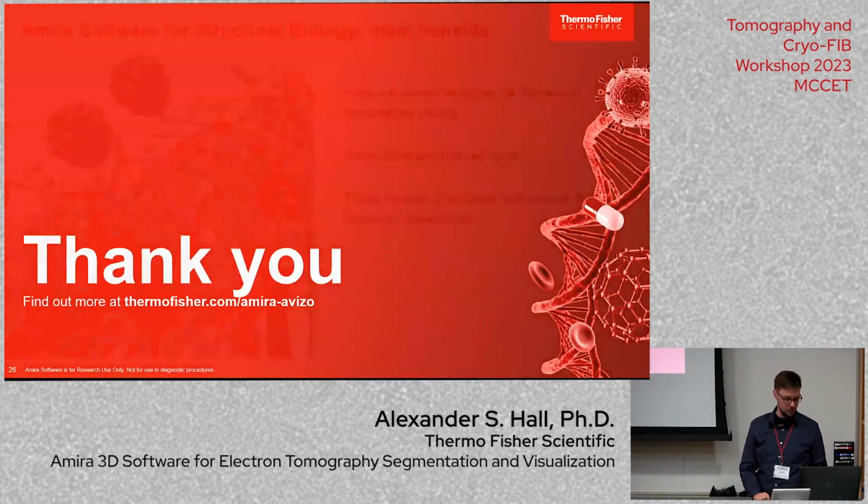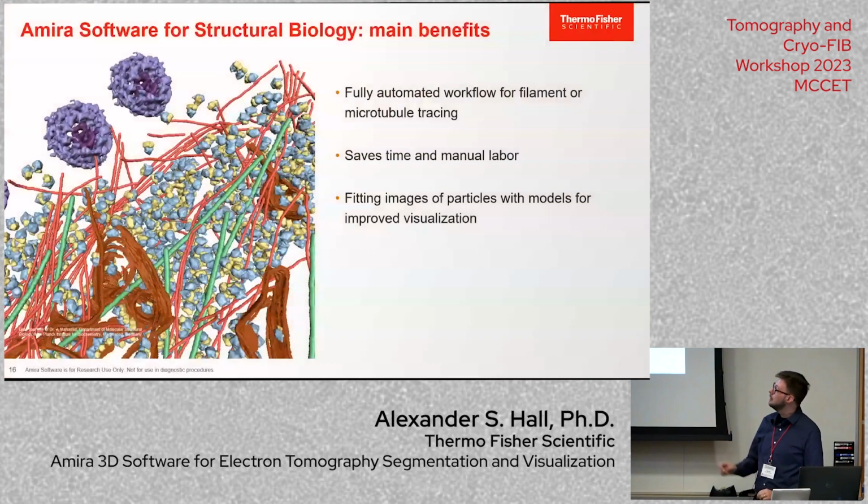Some of the slides I showed right at the end, these red traced areas, are not from voxel segmentation, like the deep learning, but actually from this tube tracing algorithm. So I think it's the better approach for that problem.